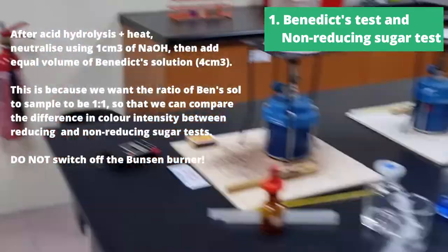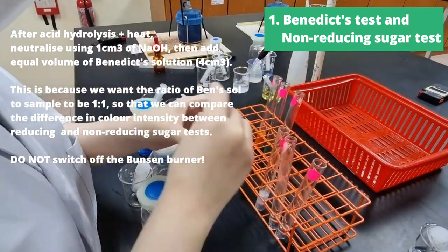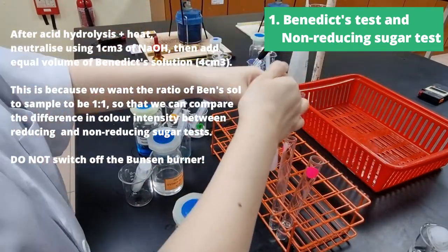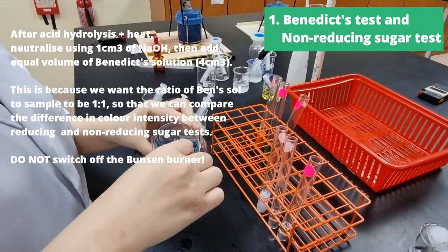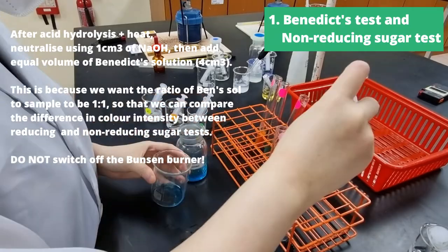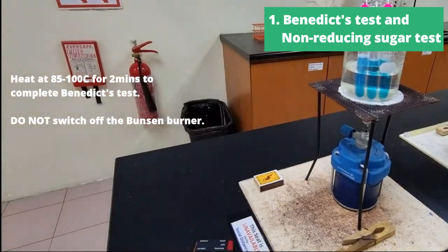Now that we're done with Benedict's test, let's continue with our non-reducing sugar test. We have finished acid hydrolysis and heating. Now we're going to neutralize it using 1cm³ of sodium hydroxide and add an equal volume of Benedict's solution — this is 4cm³ — because we want the ratio of sample to Benedict's solution to be one-to-one, so that we can directly compare the color intensity between the reducing sugar and the non-reducing sugar test.